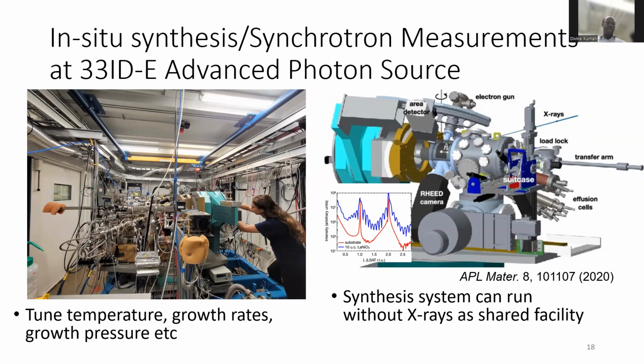And we're also doing experiments at other facilities, for example, at the Advanced Photon Source, where we can actually, during the growth, also use X-rays to monitor the three-dimensional structures of these films we're trying to grow, which we do not get when we use the electron diffraction process, right? So this MBE technique, again, is a really slow process, but there are many things you can tune to create materials which do not exist in nature. And there's a lot to learn using a wide range of complementary tools to study these materials during the growth.